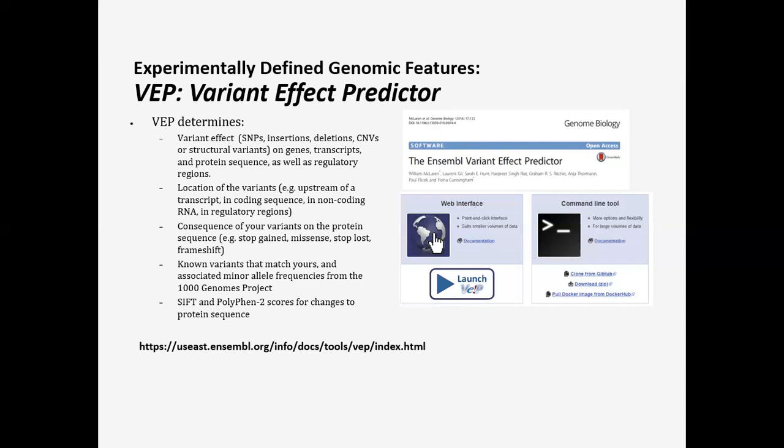But you need to know, when it comes to a new variant which is not associated, how to categorize that variant, whether it is a VUS or it is pathogenic, how you are evaluating whether it is a culprit in your sample. So that is very, very important. Yes.